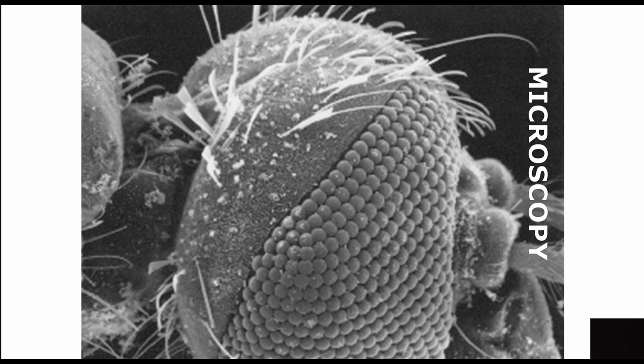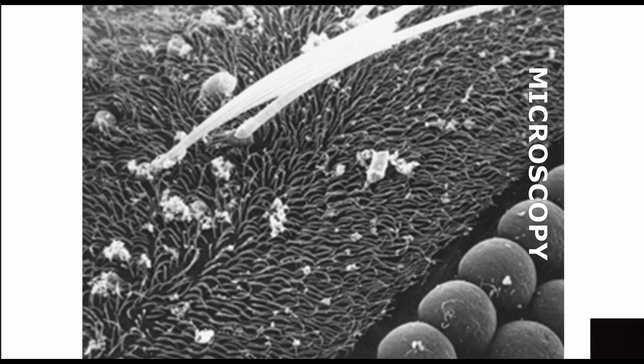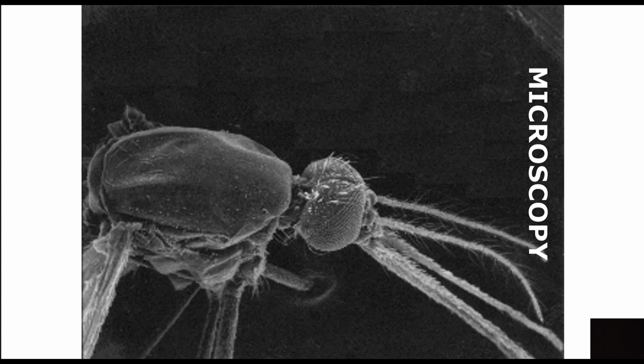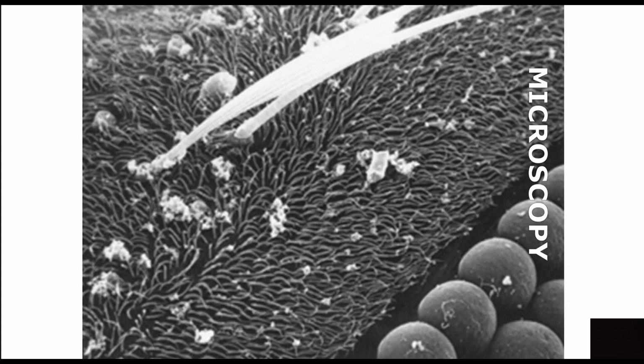And I have one more setting, so hold on to your hat. Boom. Now I'm really focused in about the best I can do with this. And so you can see I can click, and come back out, and then click, click, go back in. Now I have about, I don't know, 2-3 minutes that I can enjoy doing this before I fry it. But meanwhile, I'm collecting all the photography and I'm getting what I need out of that.